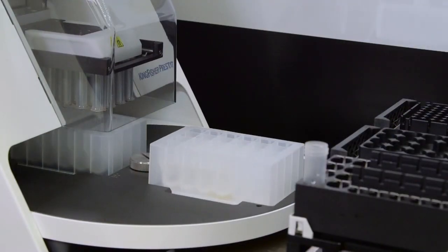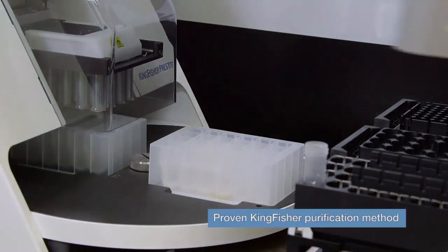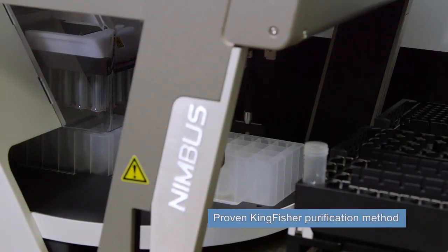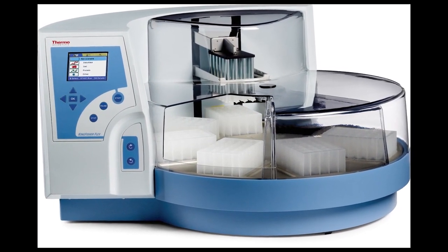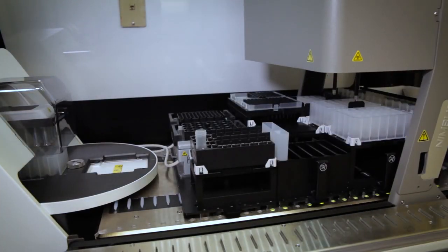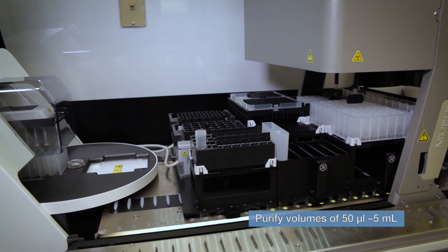The Kingfisher Presto provides the same high quality and quantity of extracted samples as our trusted Kingfisher Flex Instrument, and the fully automated system provides a continuous cycle of purification without interruption.